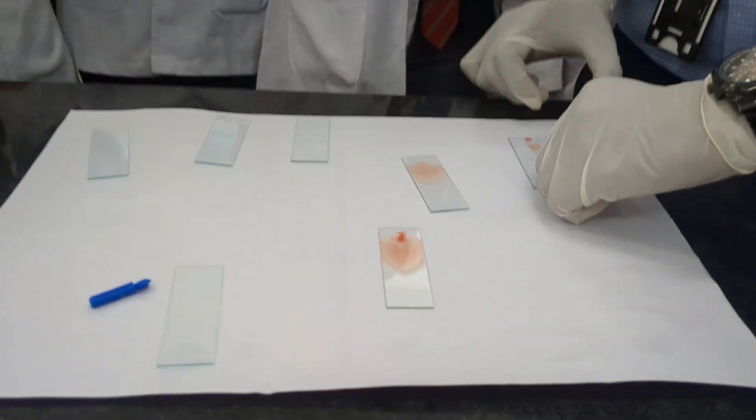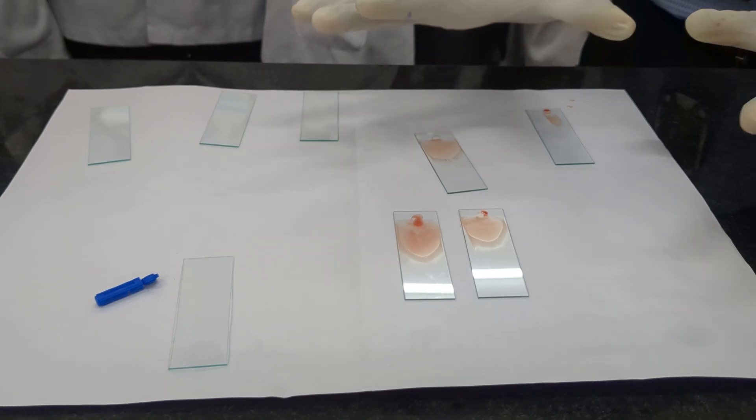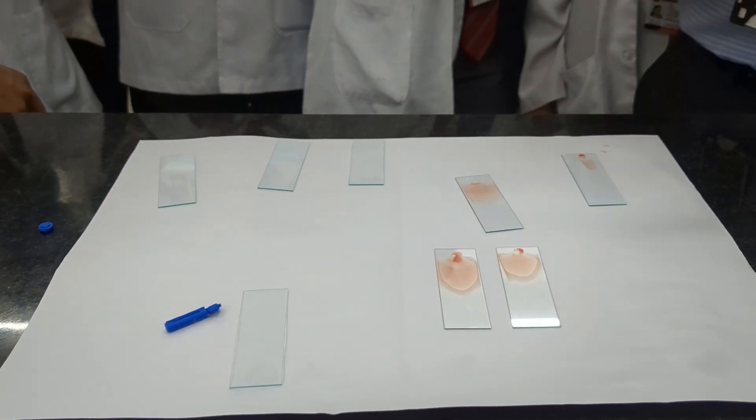This is how you get a tongue smear. These two we will consider and proceed for staining. Let them dry for two to three minutes, then we will go for Leishman staining.